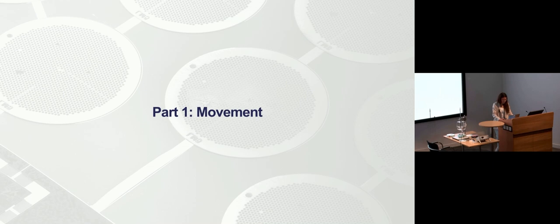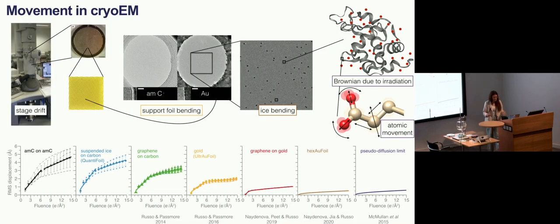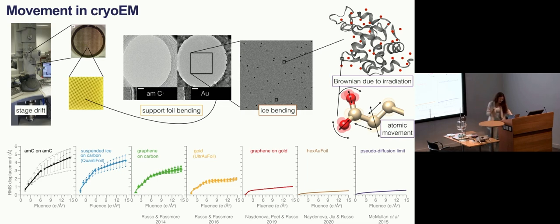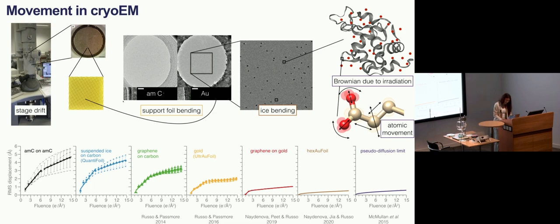The first part of the talk is about the motion of the specimen. There are different types of motion in cryo-EM, all of which cause blurring. The specimen is inserted on the cryo stage, and due to thermal gradients or mechanical vibrations, the whole stage with the specimen could move. On top of that, the specimen — a 3-millimeter grid with a thin foil — can bend during electron irradiation, as shown in these movies where we see the edge of a hole in the foil moving during exposure to the electron beam.